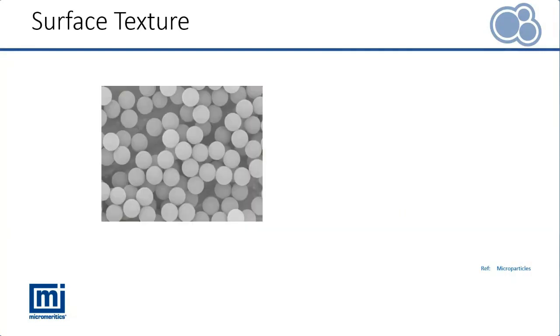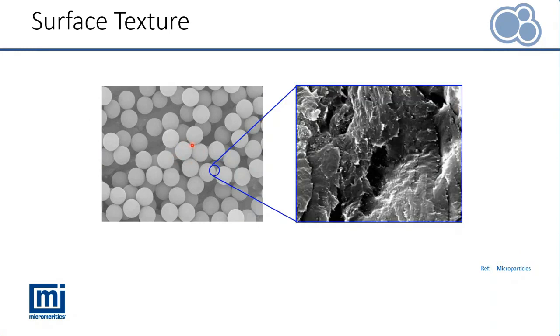And if we just take these smooth spherical looking particles, and if we zoom in with the microscope, we can see there is a degree of surface texture there. So we could be limited, in this example, in to what extent we can image these particles.